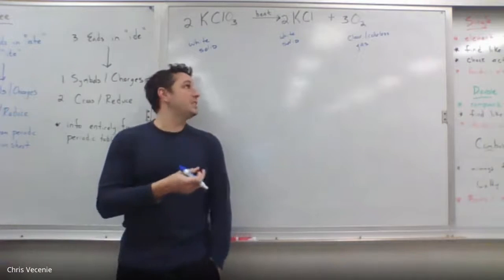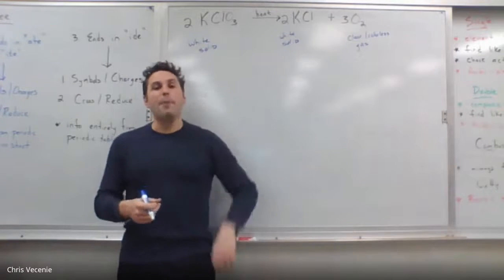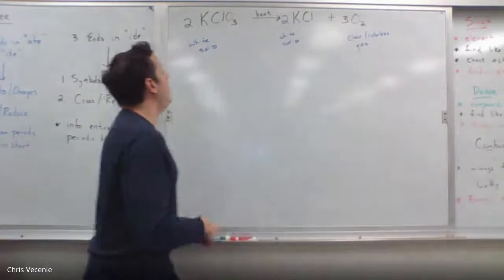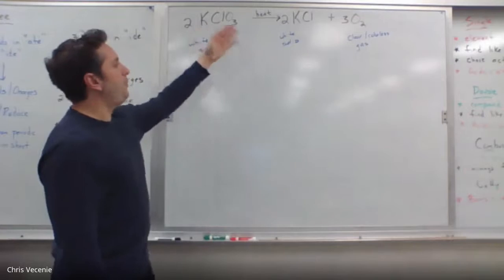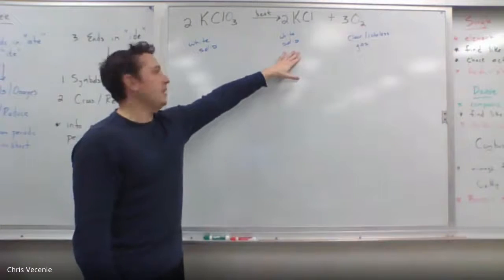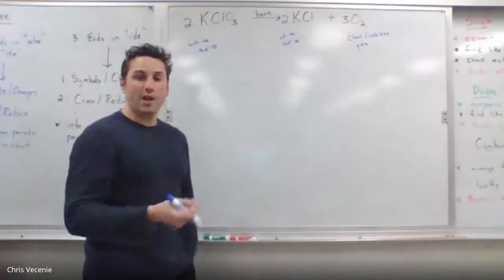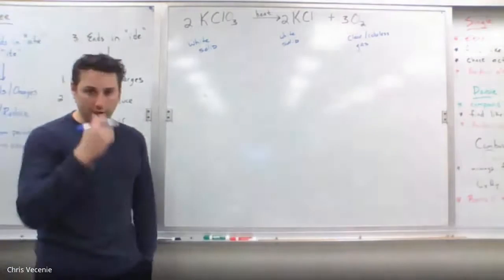This is one of those instances. I can know how much oxygen was in this guy by how much missing mass there is, because I know whenever I heat this thing up, the part that stays behind, the solid, is the potassium and the chlorine, and the part that went away is the oxygen. So my missing mass is due to oxygen.